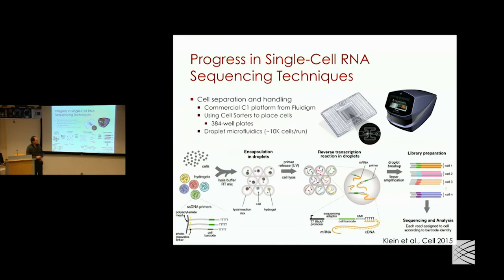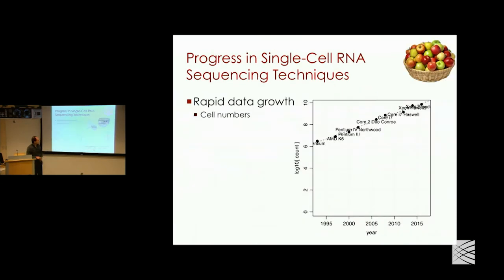Again, the idea is that you encode the cellular barcodes that maintain the identity of the initial droplet in which the cDNA was produced. You also have unique molecular identifiers here to compensate for some of the distortions of the amplification. Analysis of all these sequences has its own problems, and there are a lot of interesting questions on how to clean up these sequences, how to account for errors, and so on. This is fairly low-level work, so I won't go into it very much.